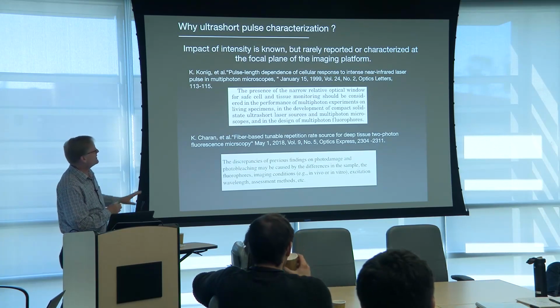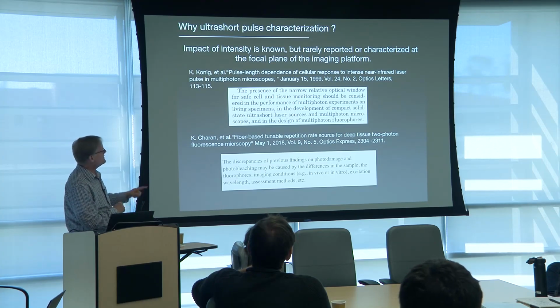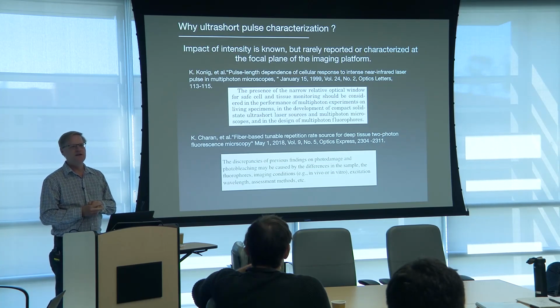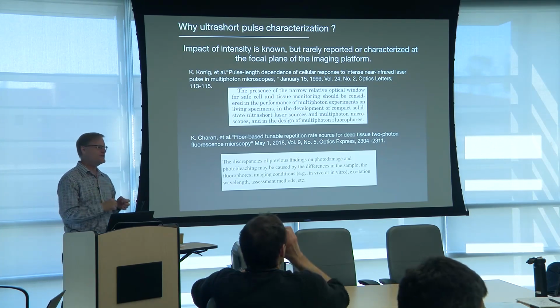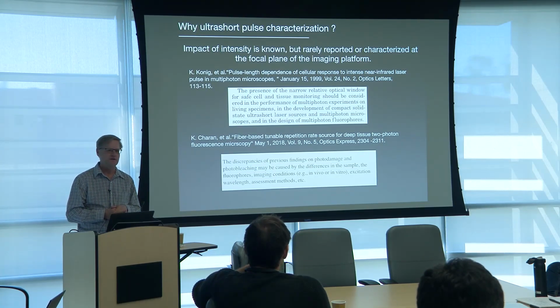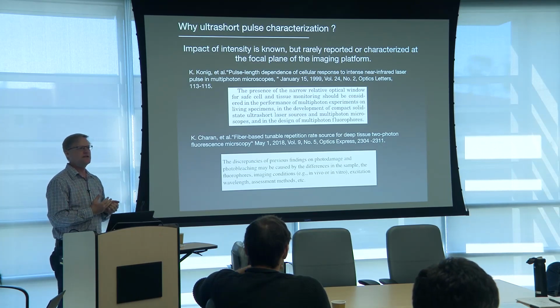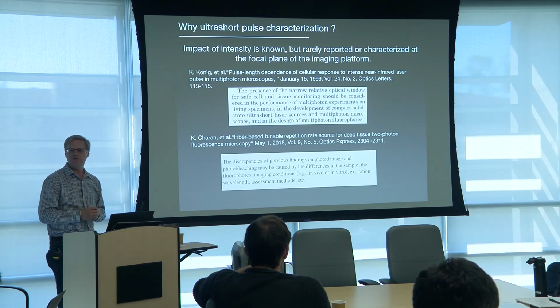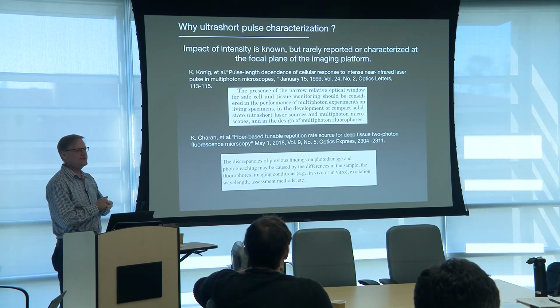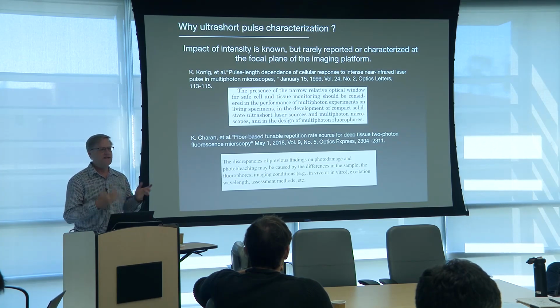But here we are almost 20 years later, and this is from one of Chris Xu's papers, and they make the comment that there are still huge discrepancies in photodamage. When I look through a bunch of multiphoton imaging papers, the intensity at focus is rarely, if ever, reported, even where they've included a measurement of the pulse duration. So I'm still on my quest to help do this, and I'm going to give you a smorgasbord of ways to do this.